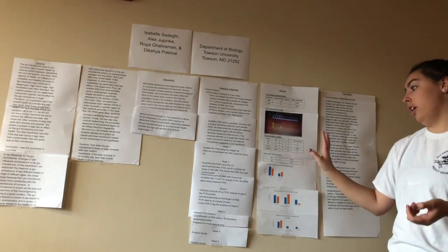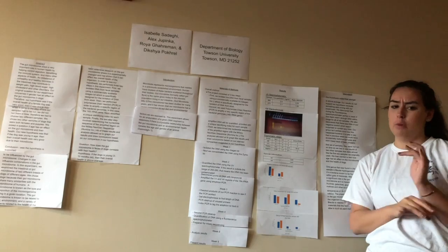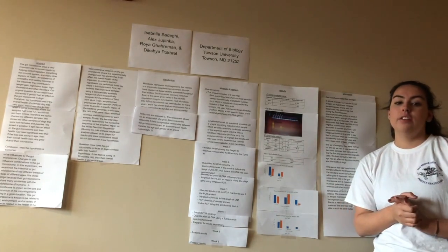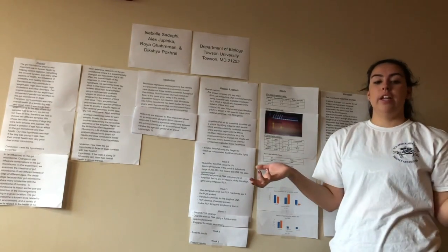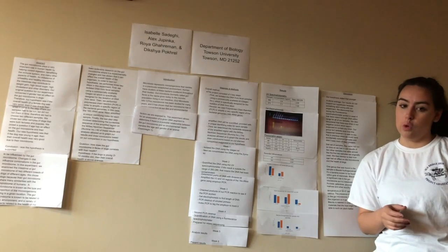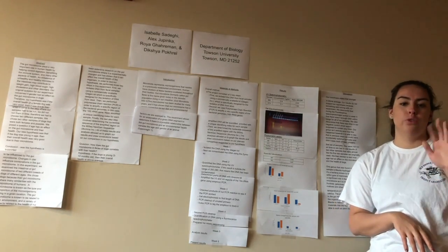So our results from our gel electrophoresis. Samples 365 and 373 had very weak, small bands, as did the negative, and the positive had some strong bands since it had E. coli in it. So the quantification of our amplicon PCR: in our samples 373 and 365, there wasn't DNA in range, but we had some in our positive control, and the concentration of that was around 15, and the amount of the buffer was 90.24.